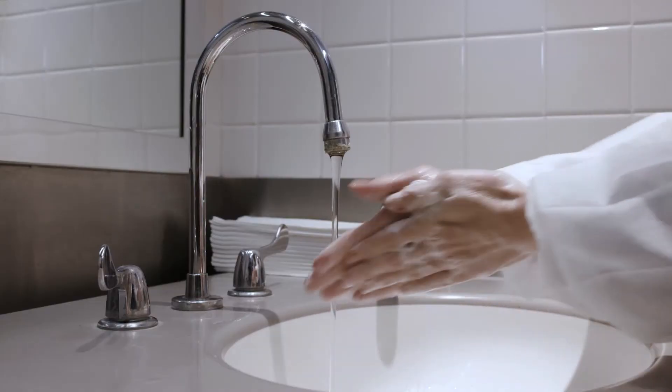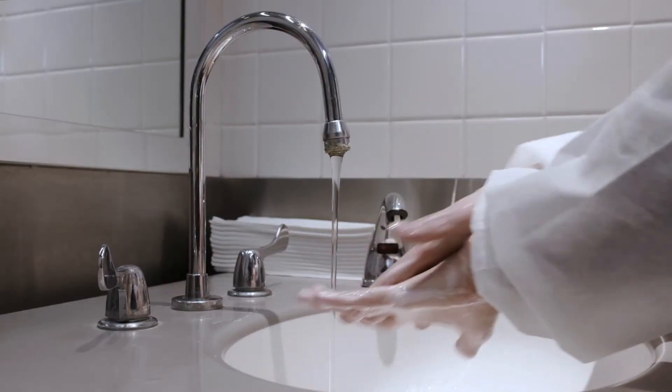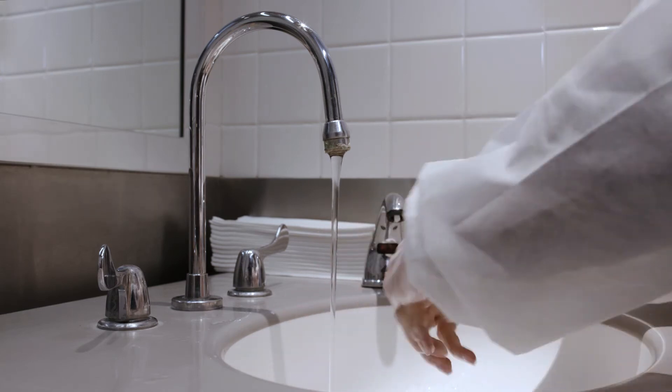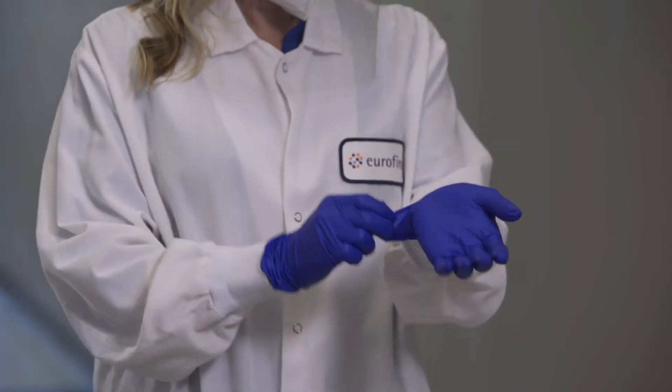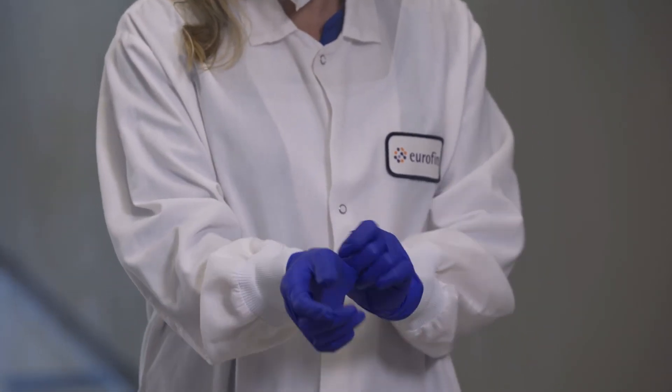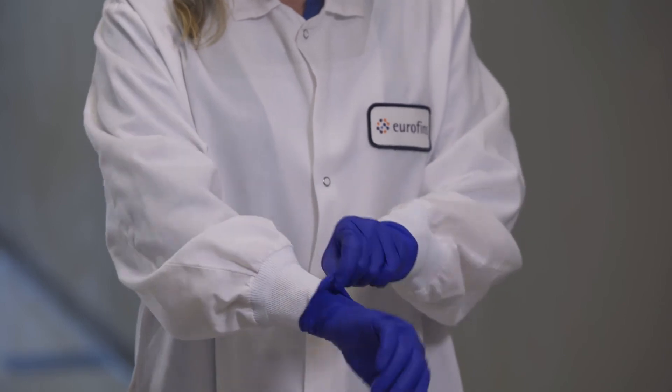After putting on all of the above PPE, wash your hands or apply hand sanitizer once more before putting on your gloves. Where possible, tuck the end of your gown or lab coat into the wrist opening of the glove to ensure a complete protection barrier.